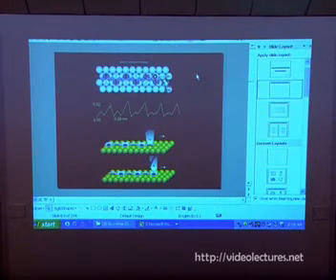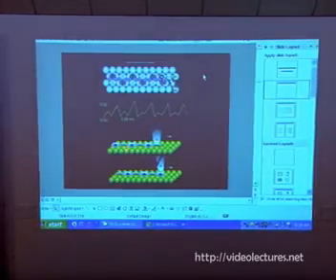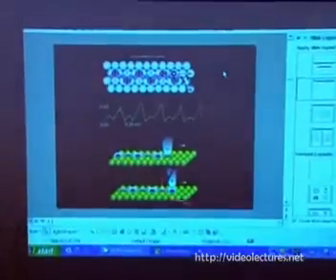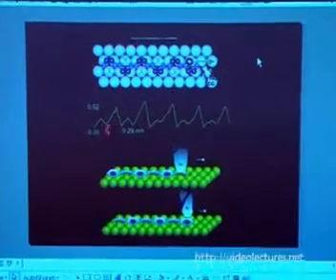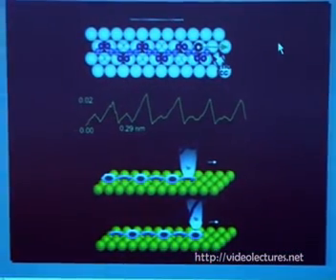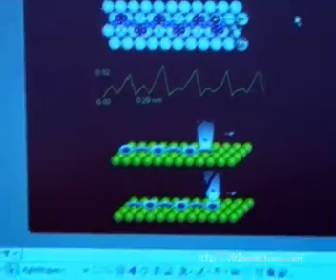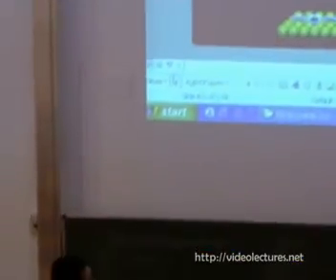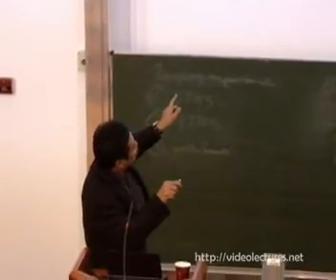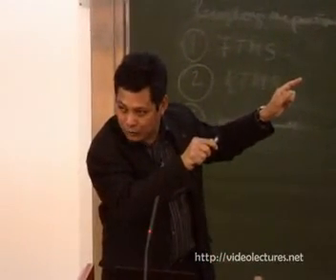All right. So how it works is, that's a molecule. First, they freeze up. Second, they are slightly twisted. In the gas phase, they are twisted about 40 degrees. We also measured it by STM and we have an 11 degree twist still. Now, the molecule is exactly lattice matched with the substrate along this direction, only in this direction.